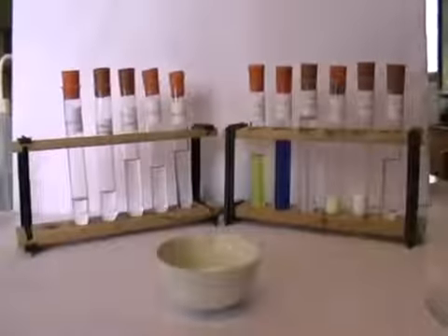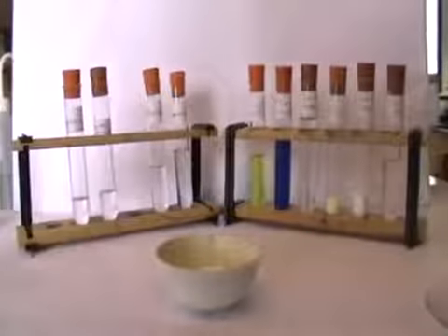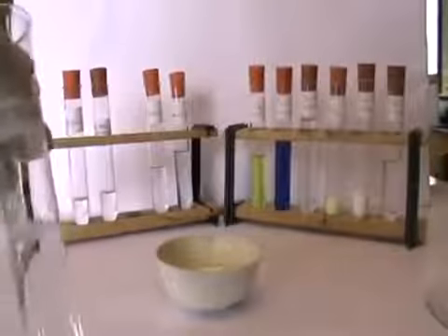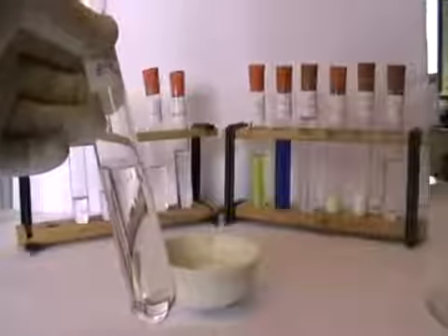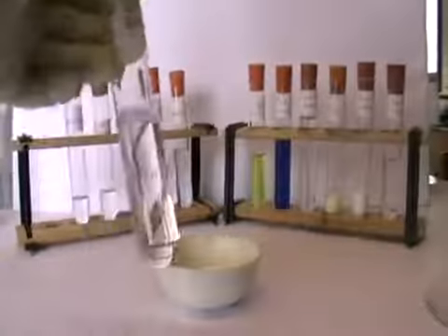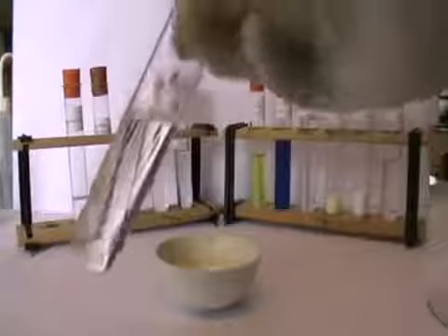Let's go to the third organic liquid, which is an ester. This is ethyl ethanoate. Its physical characteristics: it's a colourless clear liquid. In terms of its smell, it can be described as a pleasant smell, described as a fruity smell, described as the smell of fruit drops.